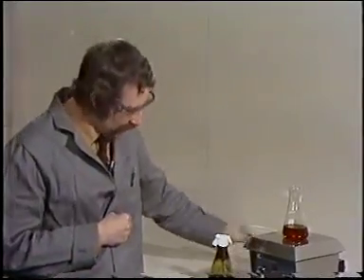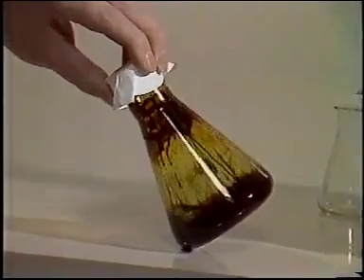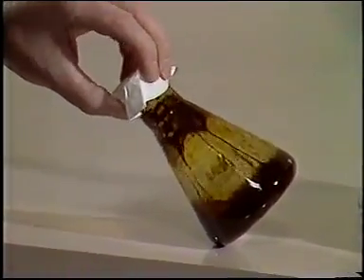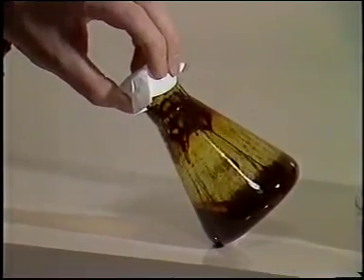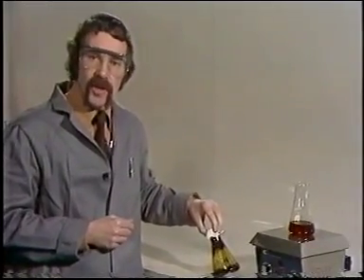After standing over the weekend, the reaction mixture looks like this. It's dark and tarry, suggesting that we have a mixture of compounds here. How do we set about separating the compounds from such a complex mixture?